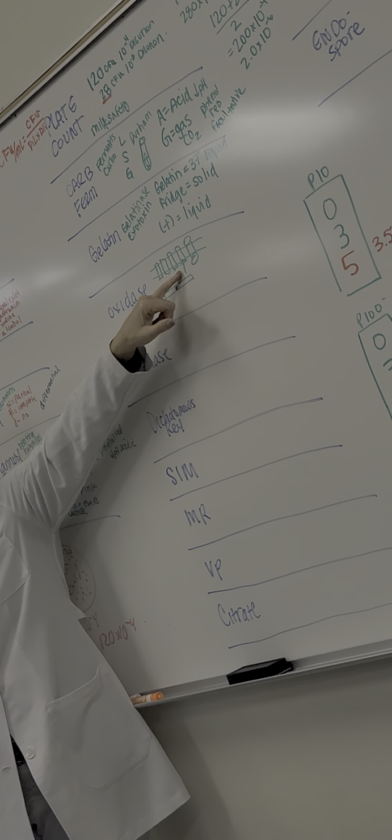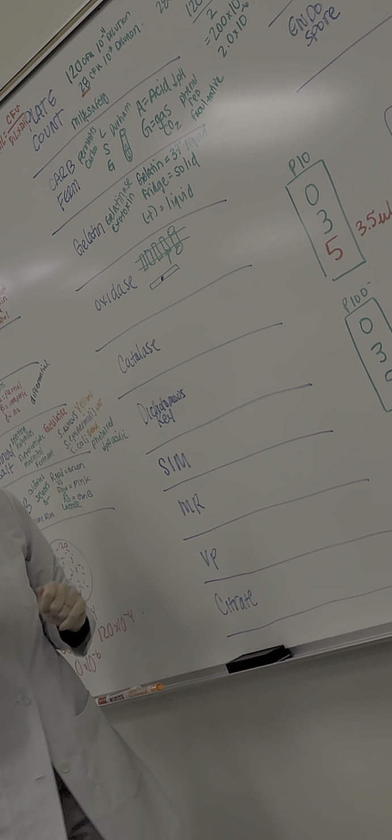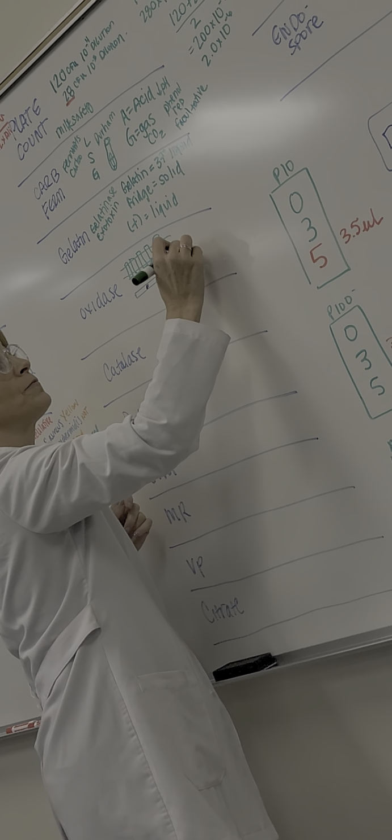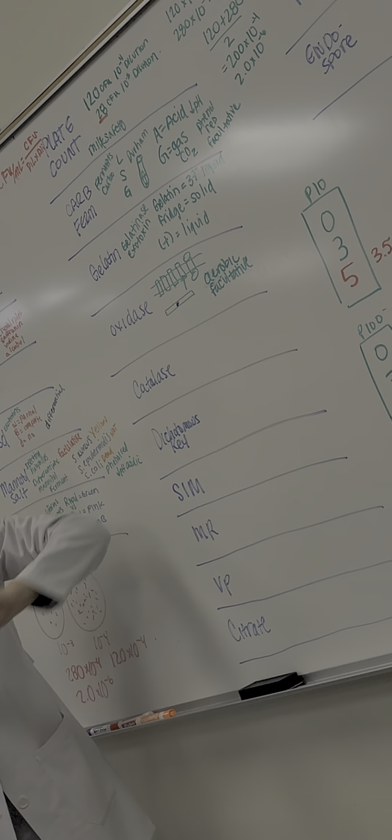And what does that tell us about the organism? Yes, way to go. Aerobic. Or facultative. Don't forget that. It doesn't mean it's automatically aerobic, it can also be facultative. Okay, catalase.